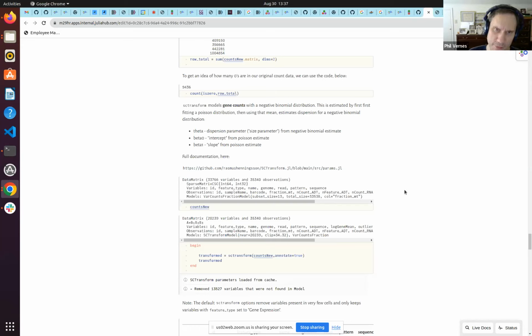And so what ends up happening is that when we fit this transformation, you'll see something. You're going to see a theta parameter. You're going to see a theta, beta naught, and a beta 1. And I assume the audience is fairly familiar with this.